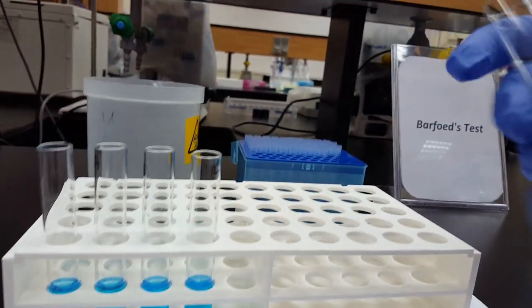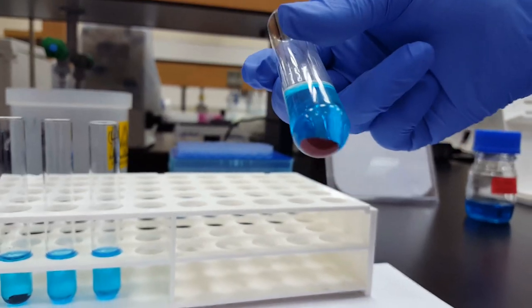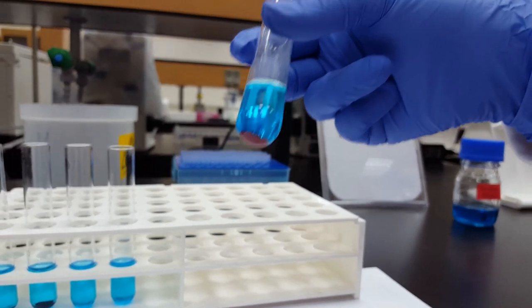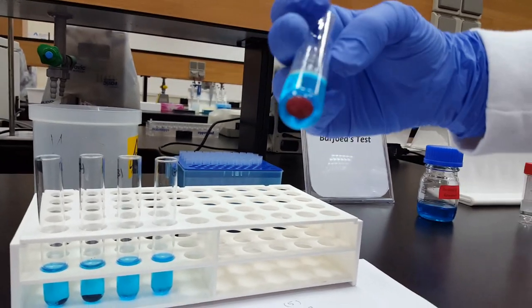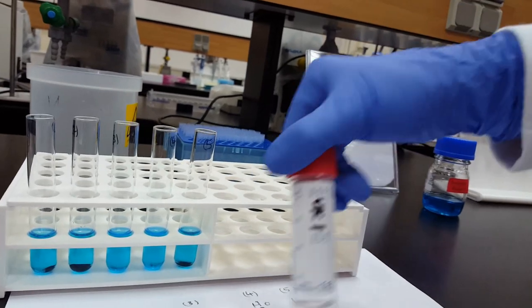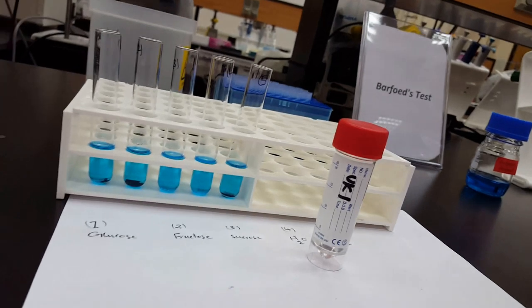What about our unknown? Now we can confirm that our unknown one has a monosaccharide. So it could be glucose or fructose or galactose. These are the three options that we have. So now we find out that our unknown one has the monosaccharide carbohydrate. This is the end of our experiments.